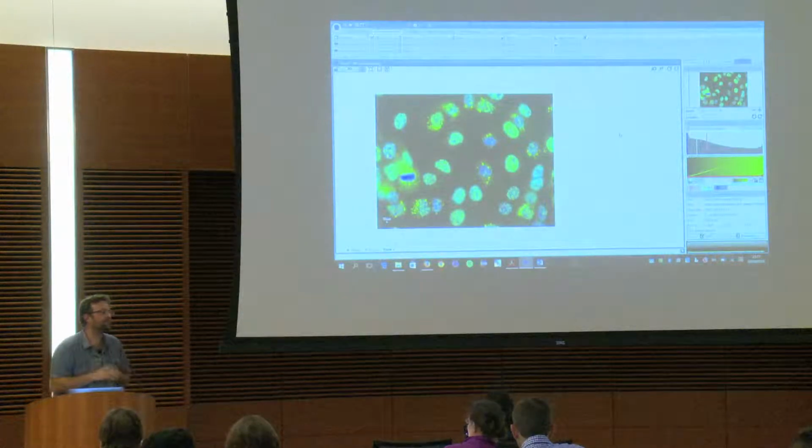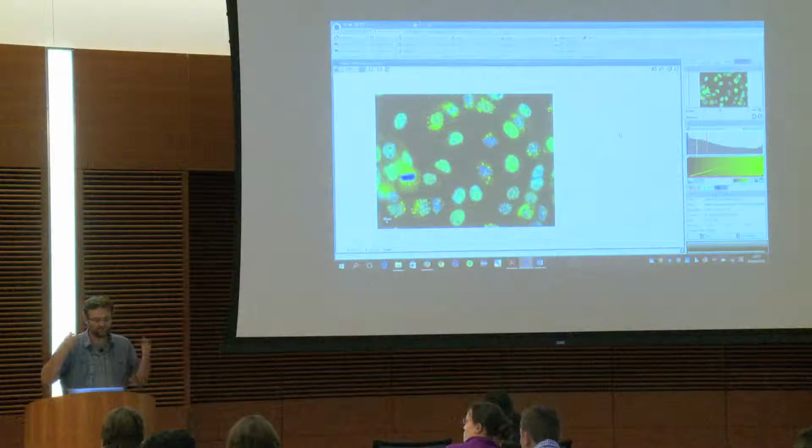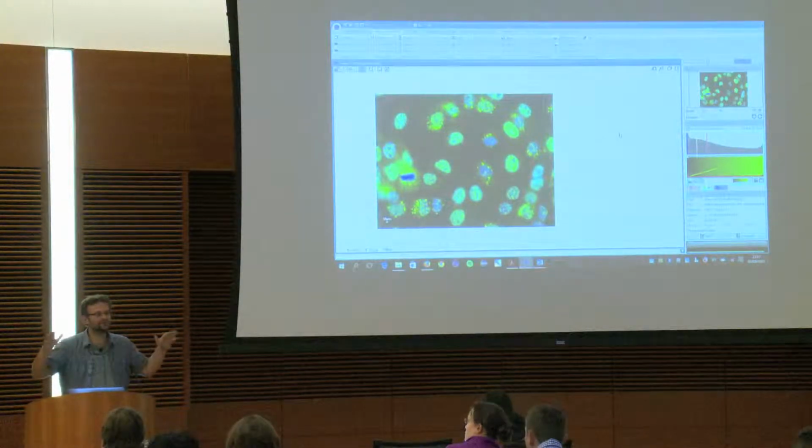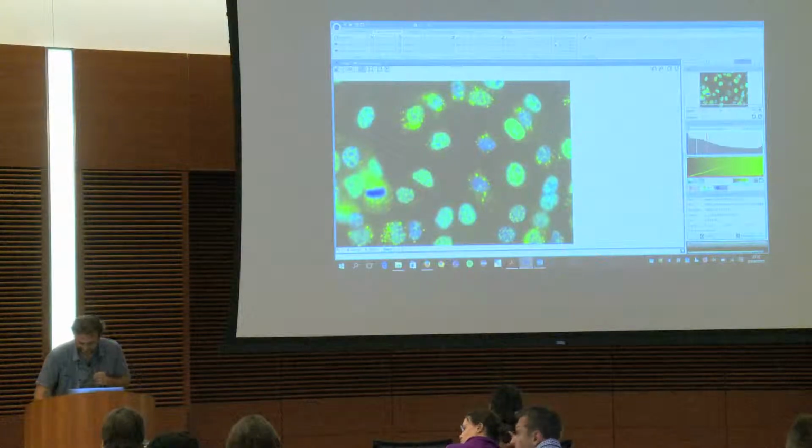In fact, people are not really interested in the analysis of this at the moment. They just want to have a virtual microscope, which is completely a problem at the moment. So each time we say don't use JPEG, keep in mind that a number of commercial softwares do JPEG behind your back.